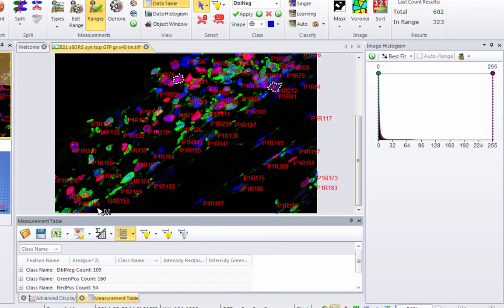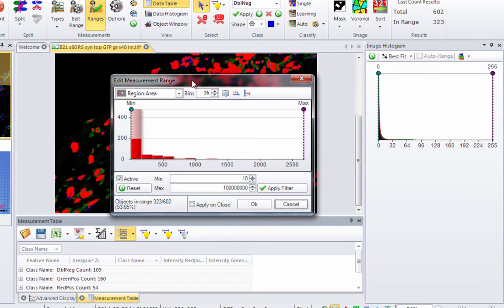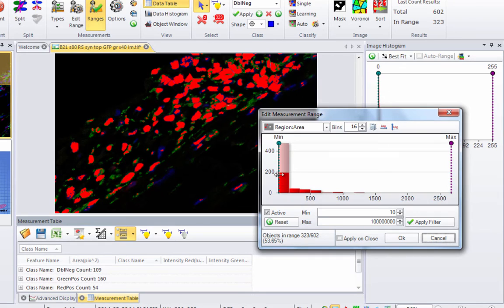Obviously, this count is not perfect. One thing you'll see is that we have lots of very small objects that maybe shouldn't be counted. So when we did the count originally, there was an option to filter objects based on their sizes. So we could eliminate objects that are too small to be truly reliably counted.